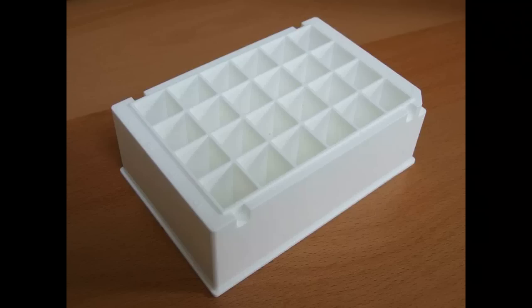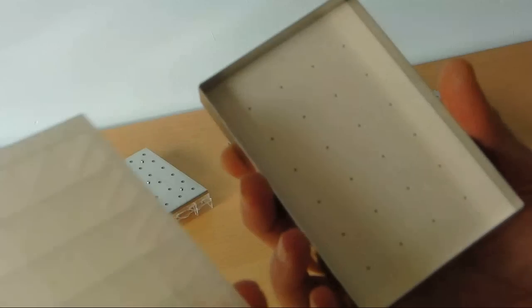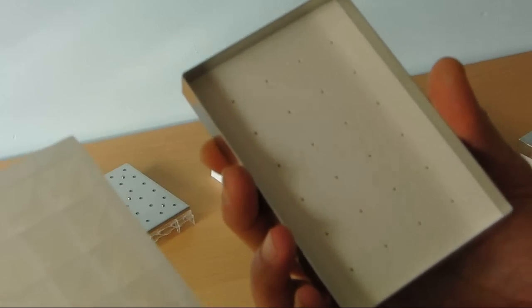As said in the introduction, we have sandwich covers with large holes in the silicone layer for fast-growing strains and a version with smaller holes for slow-growing cells.